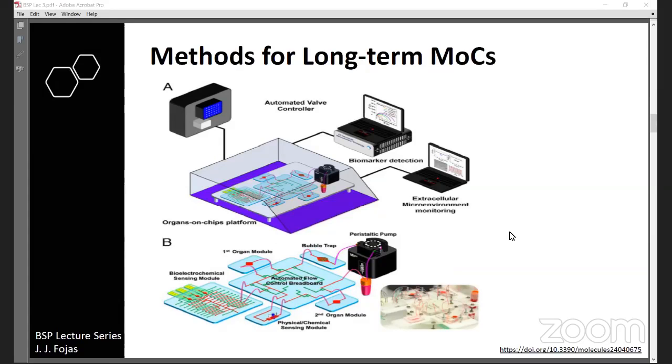do as well, really. And it gives aesthetic to your device as well. It makes it look more organized and more stable. And on top of that, you have an automated pneumatic valve controller. You have your electronics for your operating physical sensors. Your potentiostat is also there for measuring, of course, your electrochemical signals. And then a computer for central programming integration of all these commands.